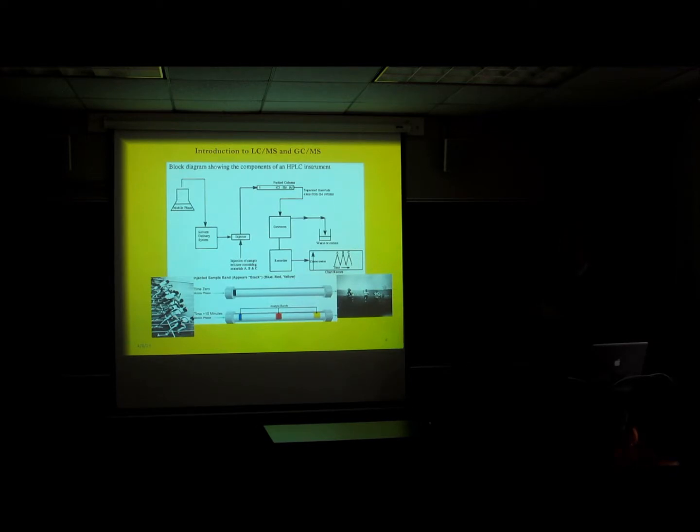One will be the separation scientists and people that do advanced liquid chromatography and advanced GC and other separation techniques, basically discussing a mass spectrometer as if it's just a detector for doing separation science. On the flip side of that coin, mass spectrometrists will, in a tongue-in-cheek way, discuss chromatography as just an inlet for doing mass spectrometry. So you'll hear both of these, and there's always the pro-mass spec crowd and the pro-liquid chromatography crowd.